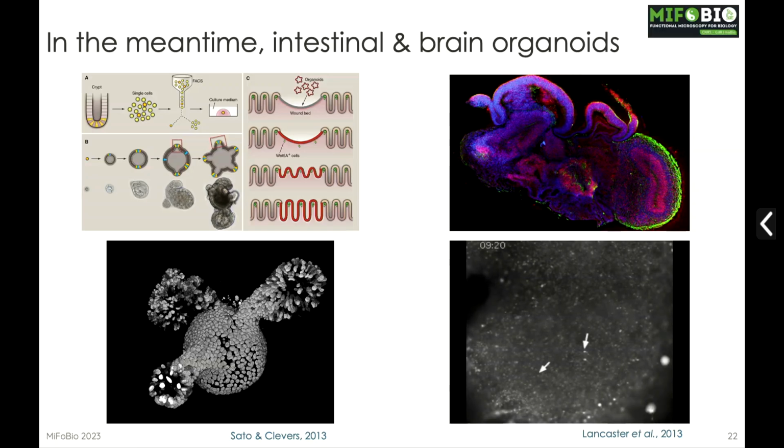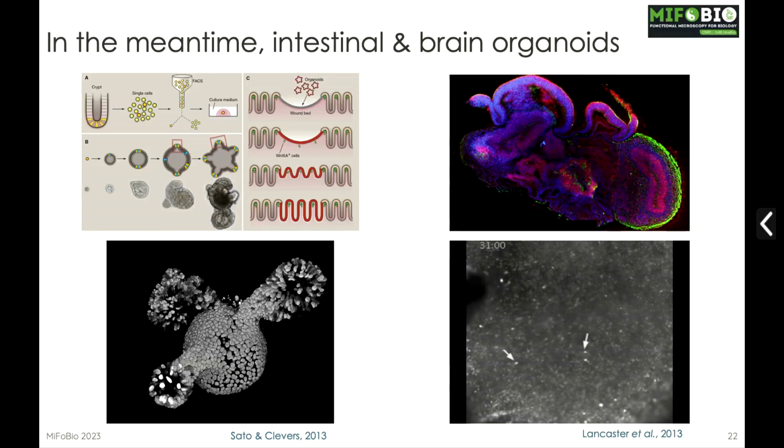And then the thing is that in terms of imaging, what does it change to have those types of samples regarding the previous ones? Because embryos, whether mice or zebrafish, basically grow in salted water. They have all the nutrients inside as yolk, pellets, or a big yolk.